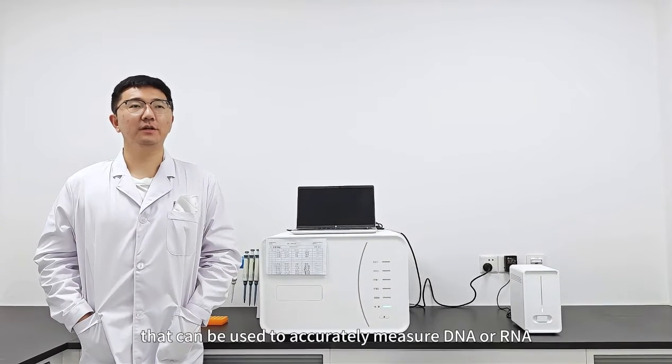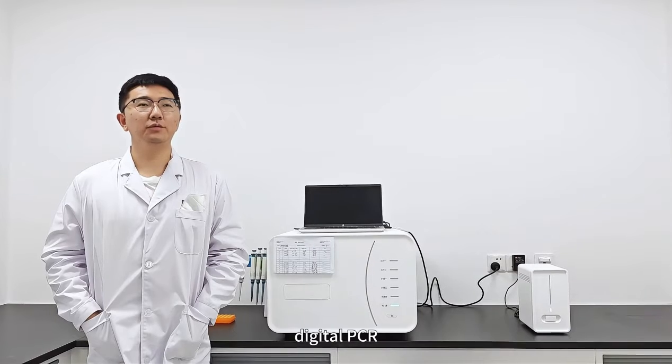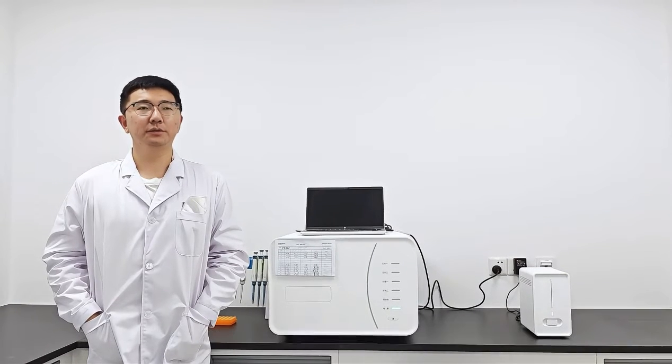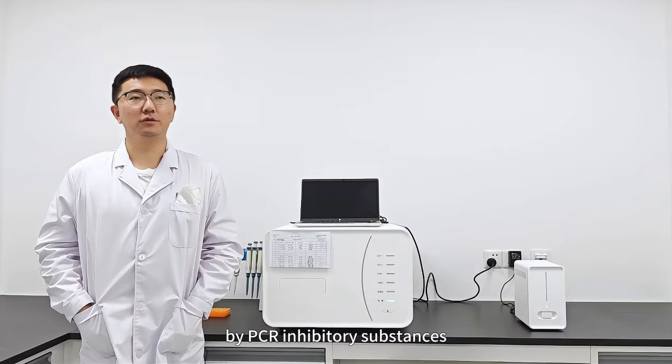Digital PCR is a highly sensitive nucleic acid quantification technology that can be used to accurately measure DNA or RNA. Compared with the traditional qPCR technology, digital PCR can quantify a small amount of nucleic acid samples more accurately and is not easily affected by PCR inhibitory substances.